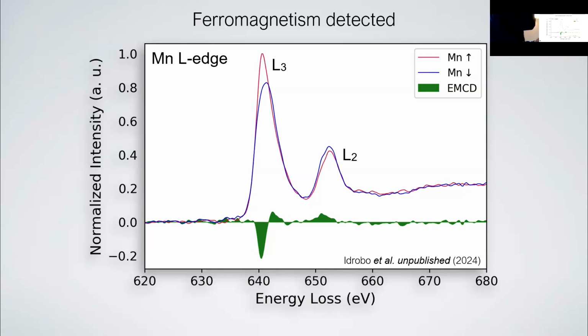If I look at your probe before on your image, when you're at the position of the atom of the second line, you're actually probing the atom of the line above and below. How do you correct for that on your scanning? Like, how do you know which atom you're actually looking at if you're not probing the one that you are actually going to?